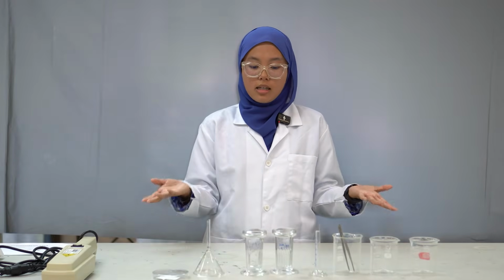Okay, I will start with TLC. What is TLC? TLC is thin layer chromatography, a solid-liquid partitioning chromatographic technique for determining the purity of material and for preliminary identification. To put it in simple words, TLC is a separation technique to separate and identify the components of a non-volatile mixture.